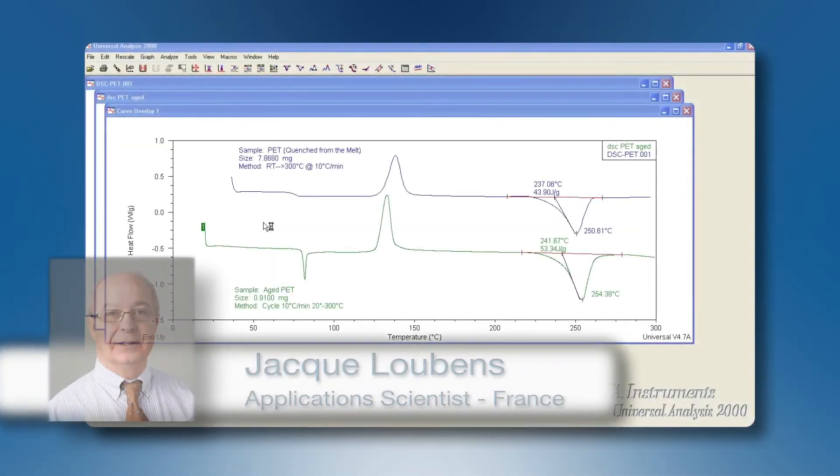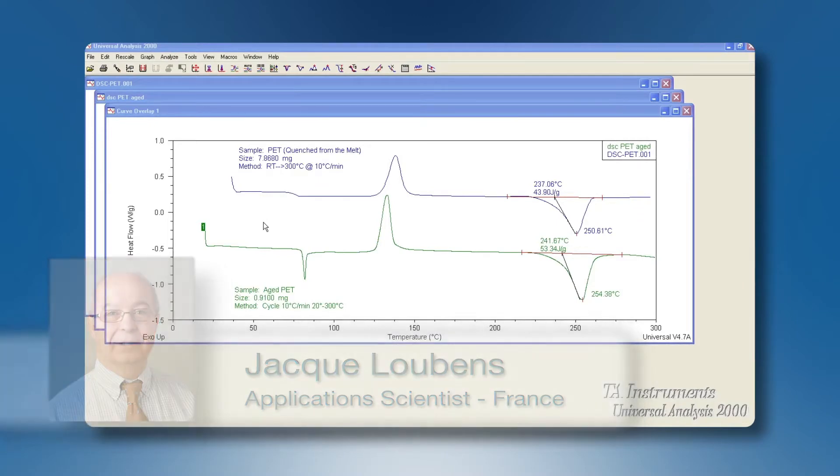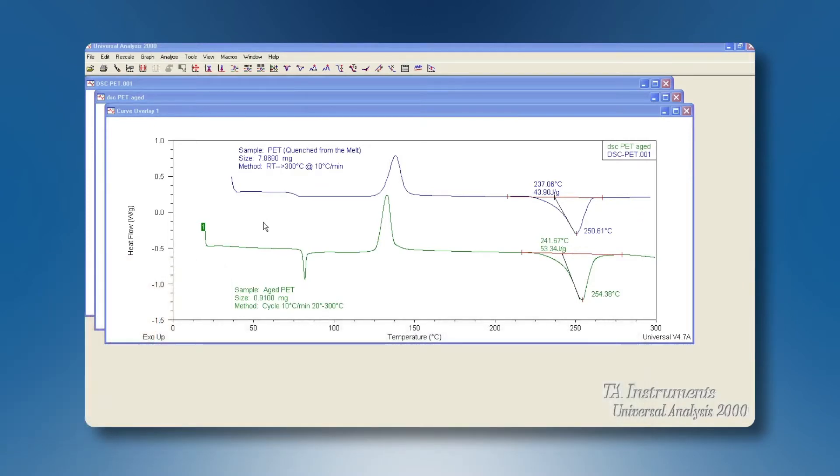In this tech tip we'll explain how to generate a custom report from Universal Analysis Data. Universal Analysis will for instance show here a 2DSC file with an overlay plot.